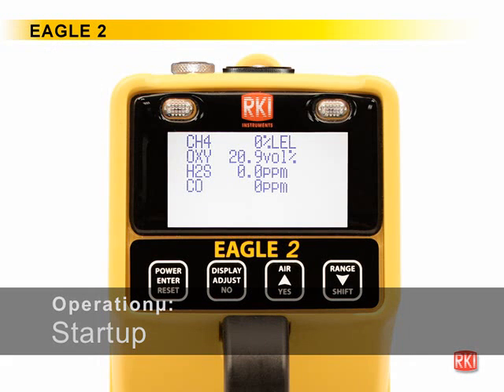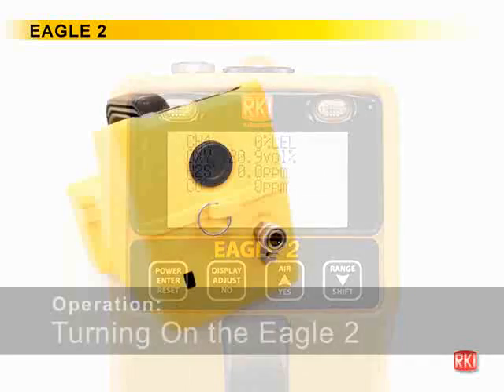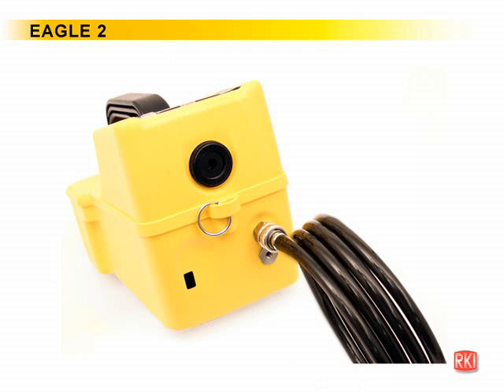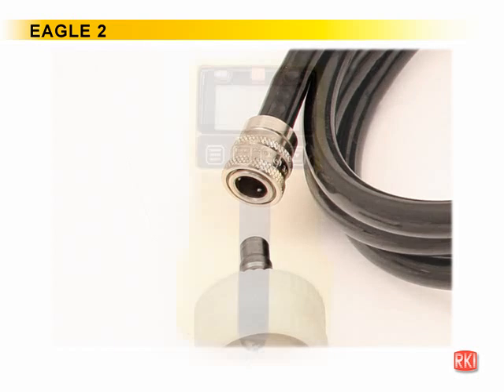The screens illustrated in this section are for a standard 4-gas unit. The screens displayed by your Eagle 2 may be slightly different. Connect the sample hose or probe to the Eagle 2's Quick Connect inlet fitting. If using a sample hose, connect the probe to the sample hose's Quick Connect fitting.